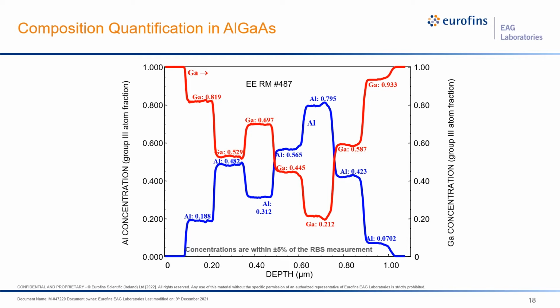So this gives us confidence that we can convert the secondary ion intensities into composition, and we can make it NIST traceable. However, precision or reproducibility is different from accuracy. You need to be able to do this from one sample to the other sample, and from reference material to the sample of unknown.